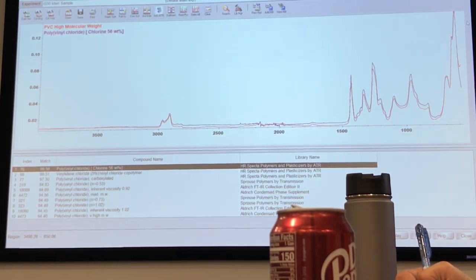So how do you do that? A lot of folks will get standards or at least some pellets. In your case, the pellets may be just 15 or 20 different pellets. Get those and either get the standards and run a reflectance, or if these are isolated particles, I would recommend running an ATR so that you have a good quality spectrum, and then run a reflectance spectrum before and after. So you know that yes, ATR told me, because I matched it to a standard library, that it is PVC. Now I'll just create a not so good spectrum using reflectance.